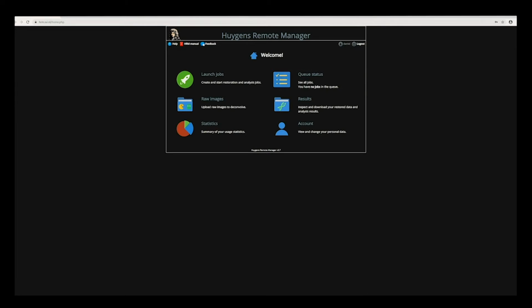Unlike in the previous version 3.6, where we introduced many user interface changes, in this 3.7 version we've concentrated on performance issues and stability improvements, and also a few small features that, even though they're small, I think can make your image processing a lot easier. So let me show you all these changes.